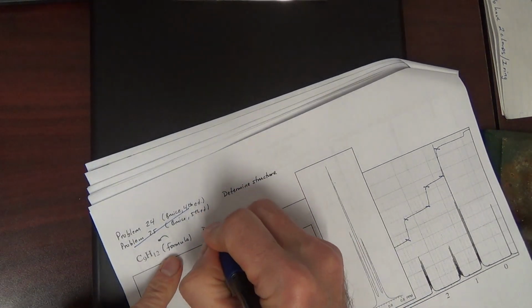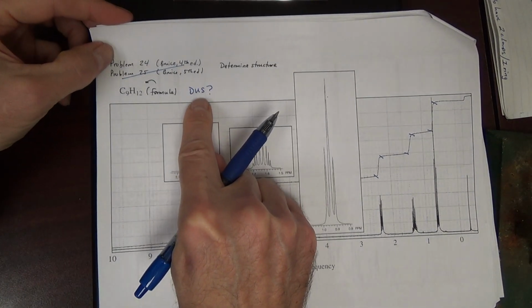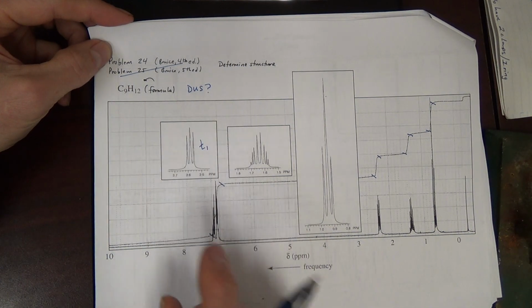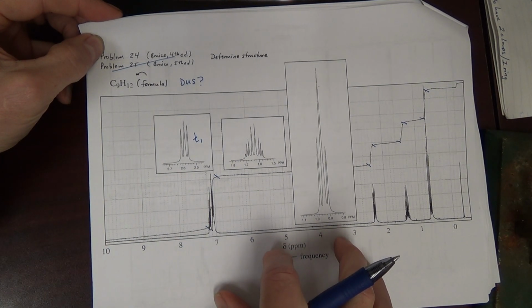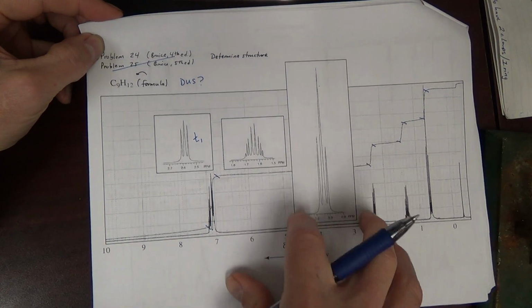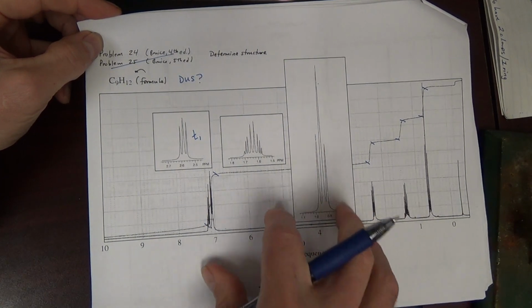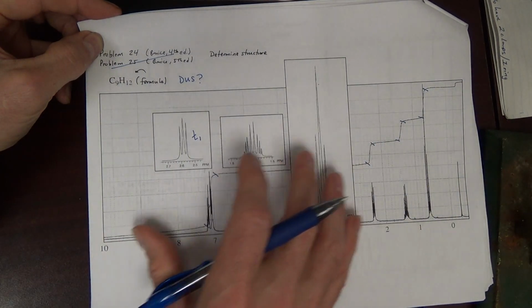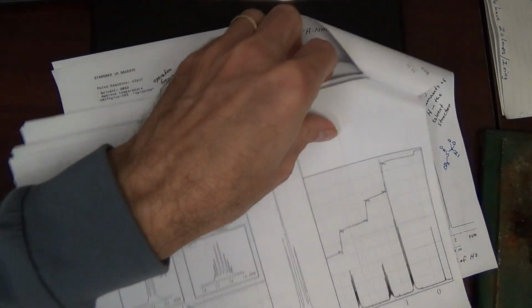We also have things like degrees of unsaturation. Remember that. Because if you're given formula, you can use DUS, and that can give you some structural information. I will also give you some sort of working hints. Okay? But what I want you to do first is give it a try on your own. Then I will give you some practical working hints, some tidbits here, some so-called free information. Okay, and we'll sort of pull it all together to determine structure here. Okay, and there's a couple of others in the handout.